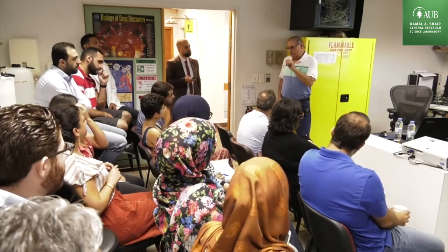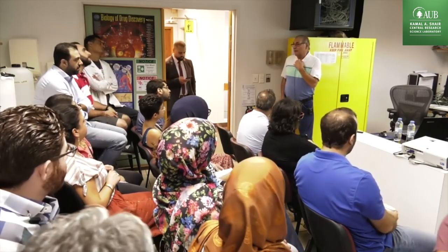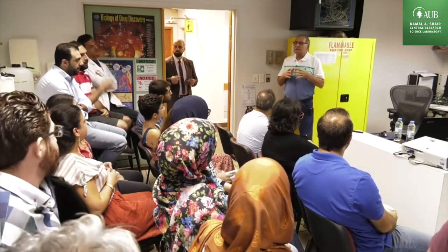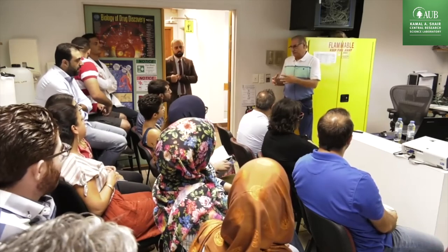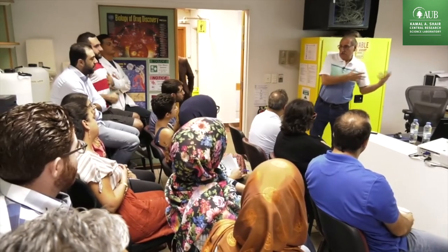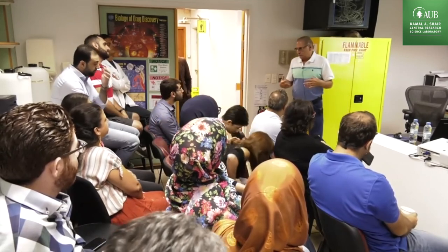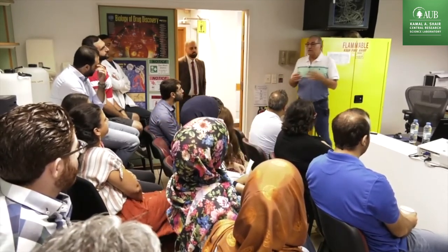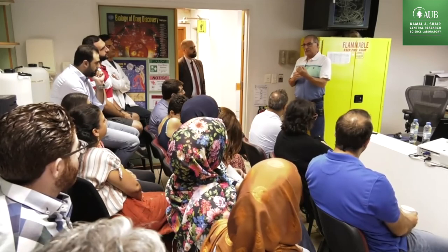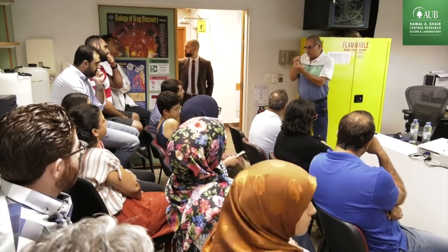Reduction, dispersion, everything. I just recently presented a paper in Brazil at a congress on the Fischer-Tropsch catalyst. The Fischer-Tropsch catalyst has 20% iron or 20% cobalt on alumina, very large particles. When you measure dispersion at room temperature and atmospheric pressure, you get between 3% and 5% dispersion. But in the reactions, they're very, very active. Why is that? When I do pulse chemisorption with CO, you have a carrier gas at room temperature and atmospheric pressure, the CO goes very fast. Only a small portion of the metal will adsorb.